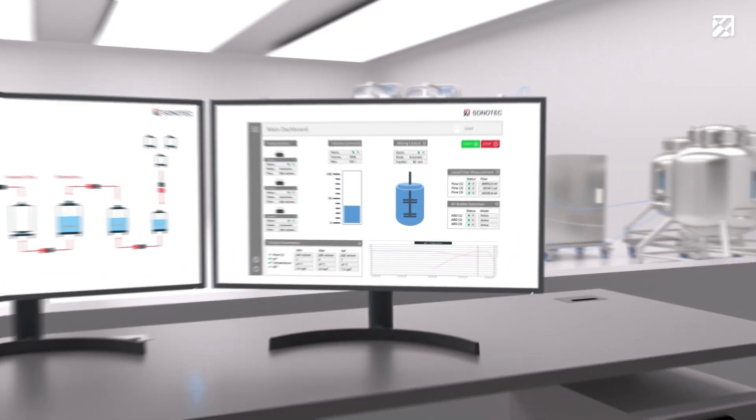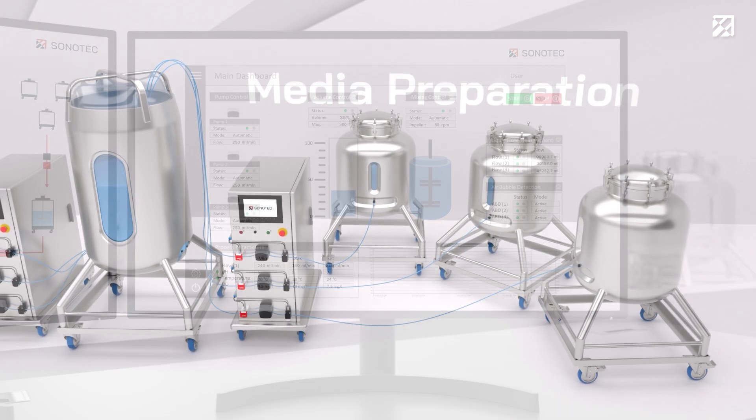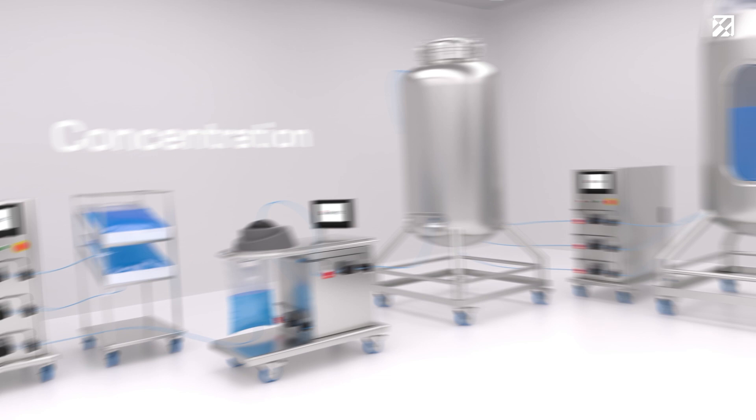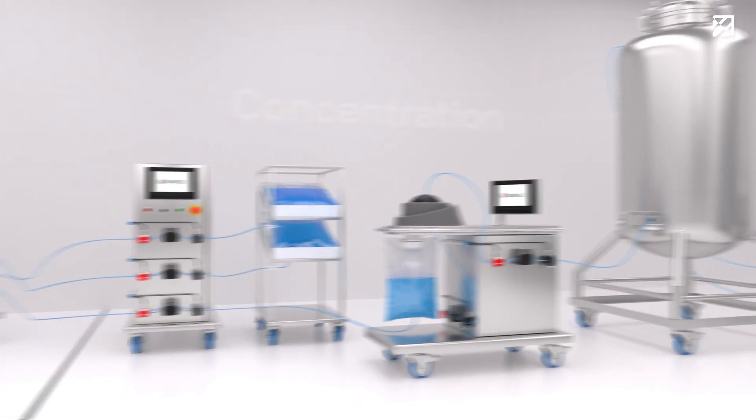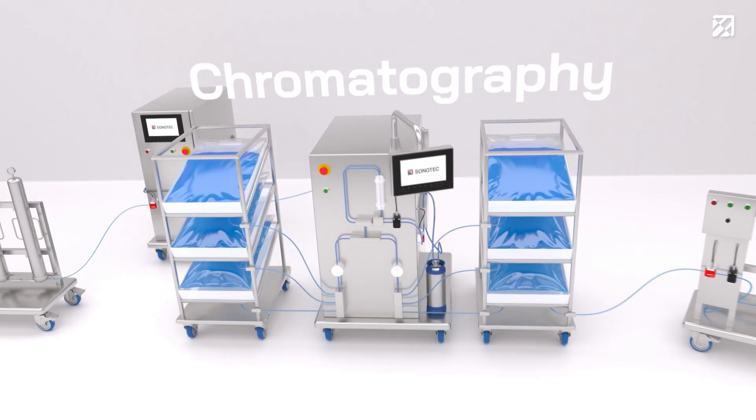Our Sonoflow CO55 flow meters support all process steps: media preparation, upstream processing and harvesting, concentration and filtration, chromatography, fill and finish.